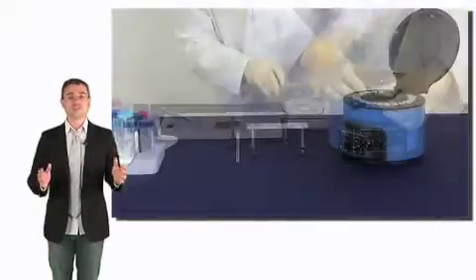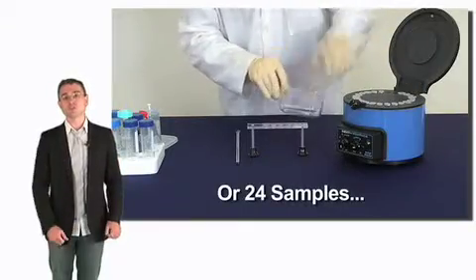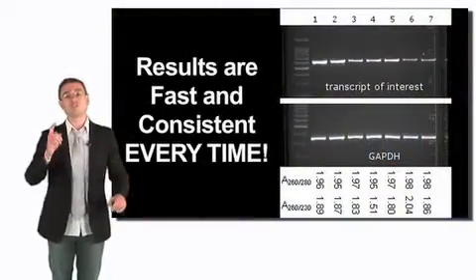Furthermore, because the samples are run at the same time using microprocessor-controlled conditions, you can be certain you'll have consistent results every time.